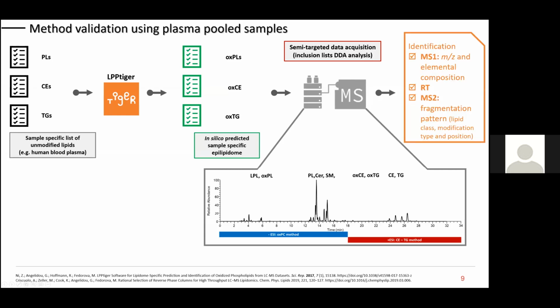And then we go for the identification. I would like to focus here on the different levels of confirmation of our lipids, so in the MS1 and the MS2, but also retention times.